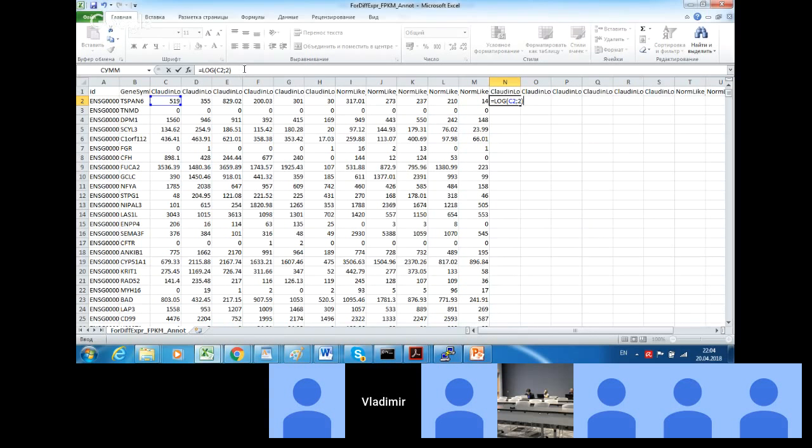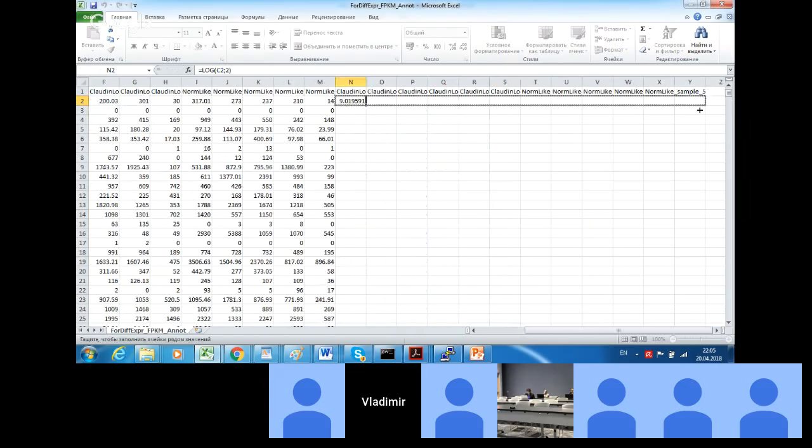In certain systems, it is comma, so definitely you know what's the correct way for giving formulas in your system. But again, sometimes it's a semicolon put here, sometimes it's comma. Then we simply transfer this formula to all our other cells.